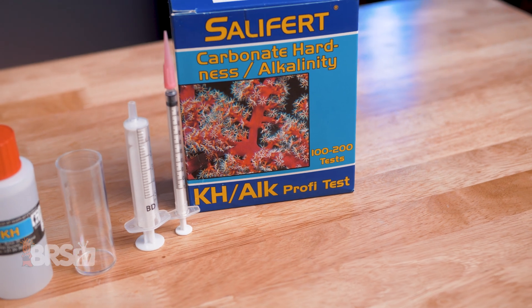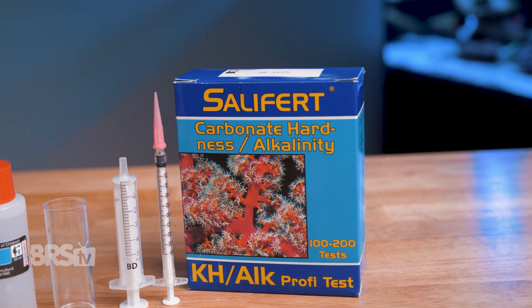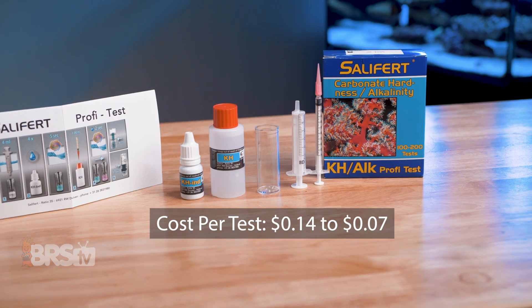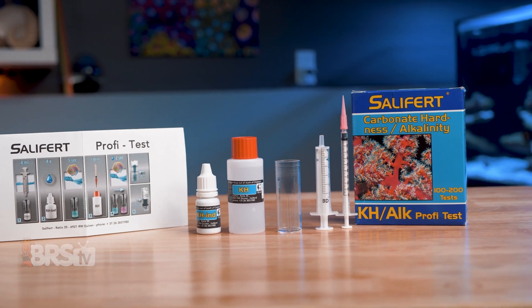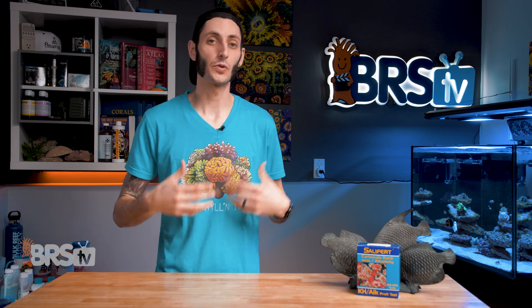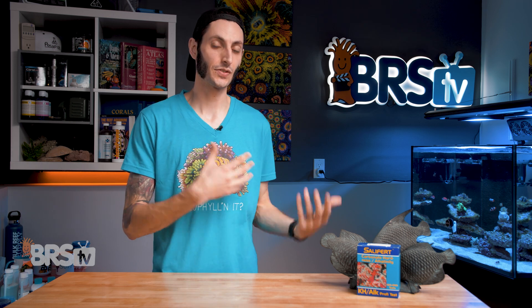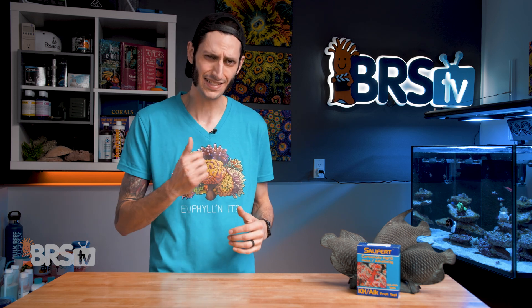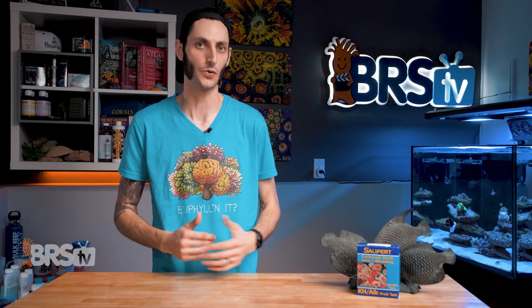The test kit will perform up to 100 standard tests or up to 200 tests if using the smaller two milliliter sample, which works out to between 14 cents on the high end to seven cents on the low end per test, and should last the average reefer just over a year of testing two to four times per week. I would recommend that you stick with the larger four milliliter sample size if you're newer to reefing or testing — that larger sample size makes it easier to get an accurate result. However, if you've been around the block a few times and are very familiar with testing and have good practices, using that two milliliter sample size will definitely take this test kit a lot further for you.